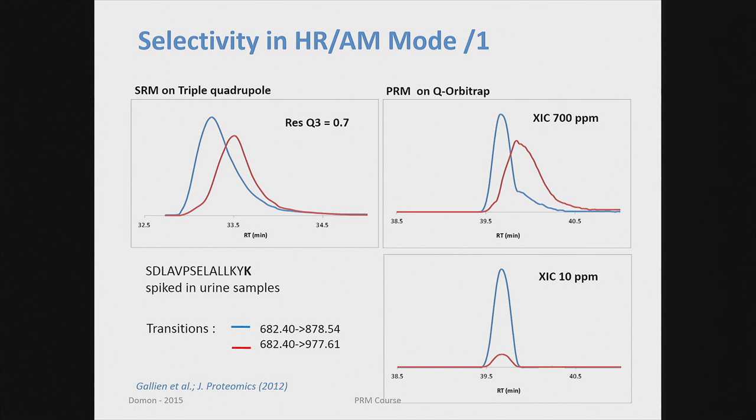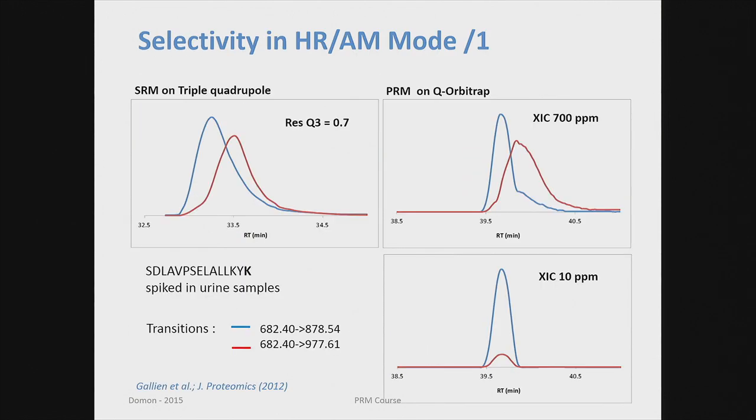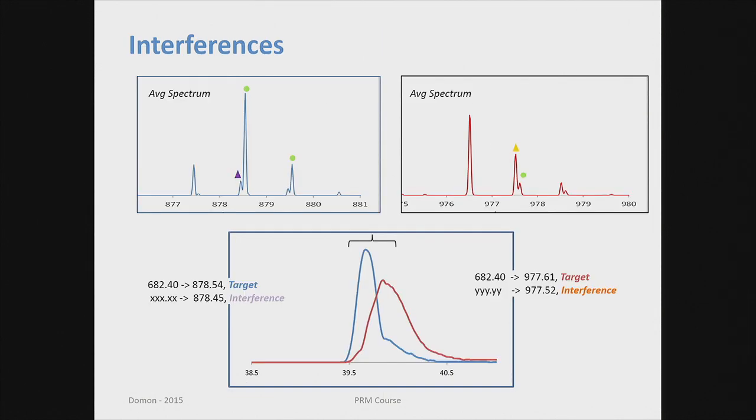Now, not only do we collect the traces, but actually we collect full MS spectra, right? It's not the full spectrum, it's only the range here. So this is basically collecting the spectra of this region here. And what I see here for the first spectrum, the green one, the blue trace here, is the fragment ions and the corresponding C13.